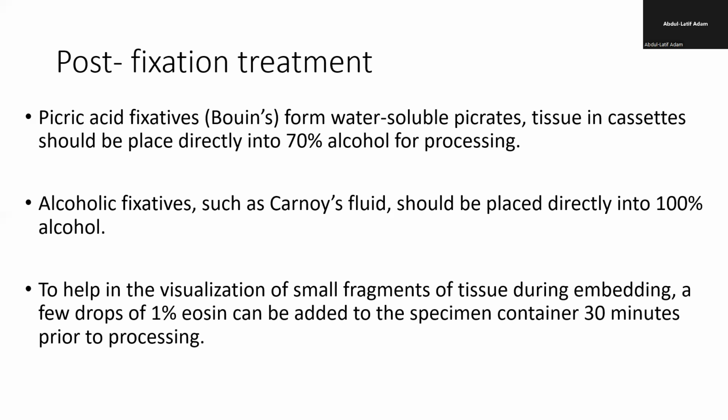Okay, so there are some of these fixatives that impart some form of color, especially picric acid fixative. So picric acid is yellow. So when you put the tissue in, it colors it. Usually, if you have very tiny biopsies that are not easily identified in the normal fixative, the formalin fixative, you add picric acid to give it color so that you are able to identify it.